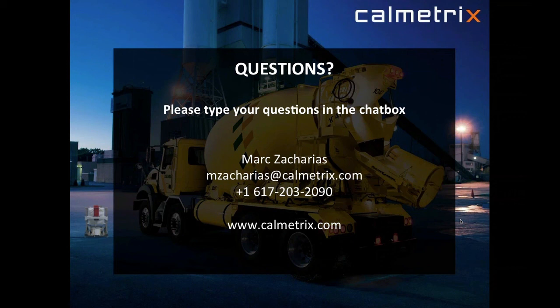For example, if you have an existing Rheometer that operates with a vane on the central axis, you could replicate those results in our Rheometer and get a comparison with what you had before. So you can definitely use ours in the more traditional way, the one that I said we shouldn't use, but it's possible. The design makes it possible.